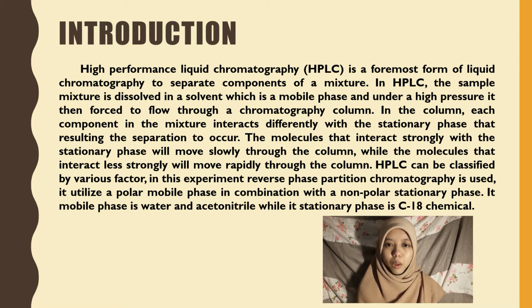It utilizes a polar mobile phase in combination with a non-polar stationary phase. Its mobile phase is water and acetonitrile. Its stationary phase is C18 chemical.